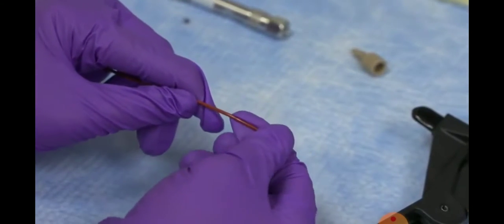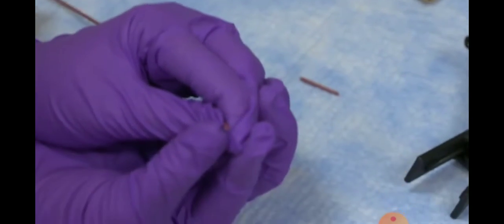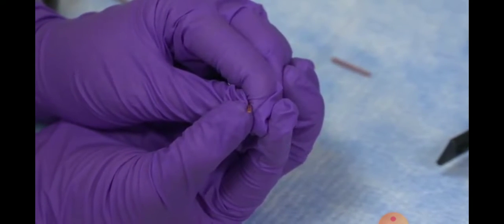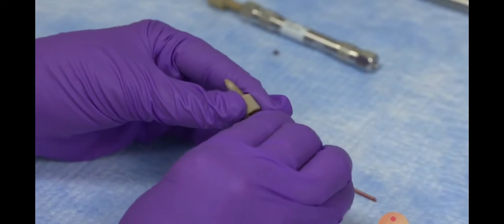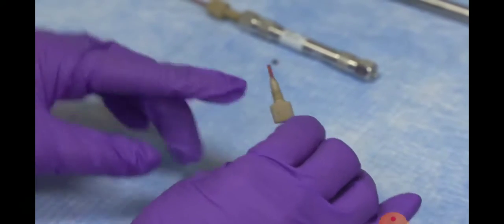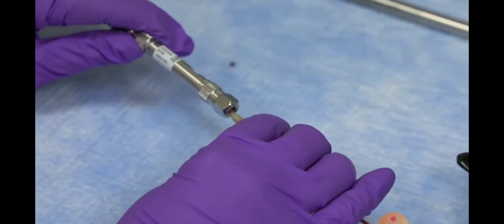Now snap the PEEK tubing at the site it was cut. This gives you a nice round shape that you can insert in the ferrule. You take this end of the PEEK tubing, insert it in the ferrule, just about an inch from this side. Take the ferrule and you attach it to the column.